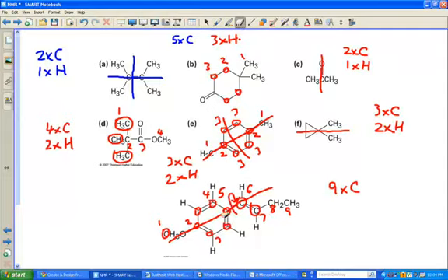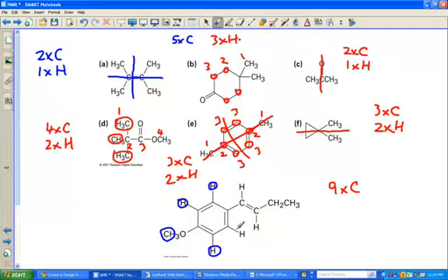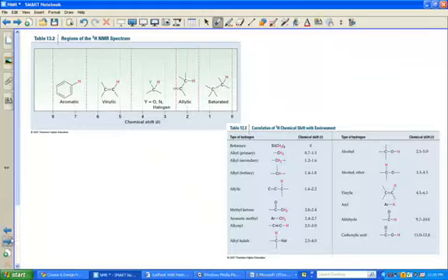And when we look at our proton signals, we'll find it's somewhat similar. Type 1, type 2, type 3, type 4, type 5, type 6, type 7. So usually when the carbons are different, the hydrogens on those carbons are also different. Okay, little bit of basics here. When you're looking at a proton spectrum, depending on the functional groups they're connected to, the hydrogens or the protons usually occur within specific regions of the NMR spectrum.